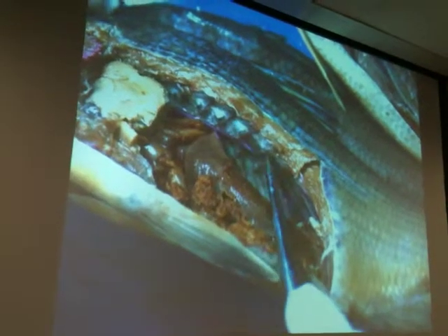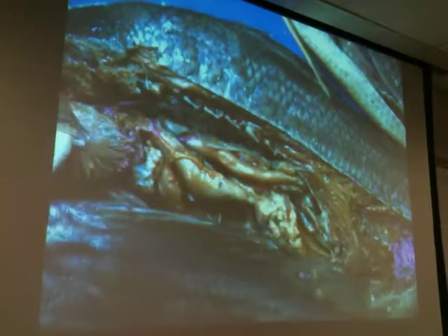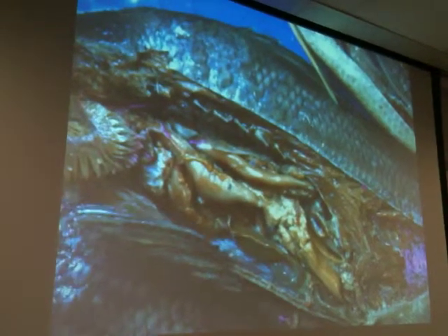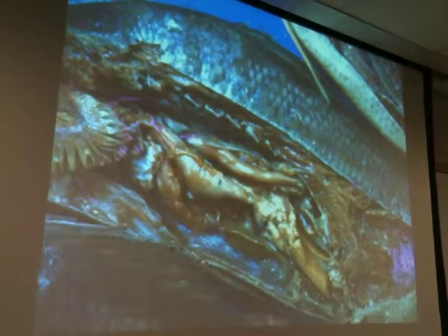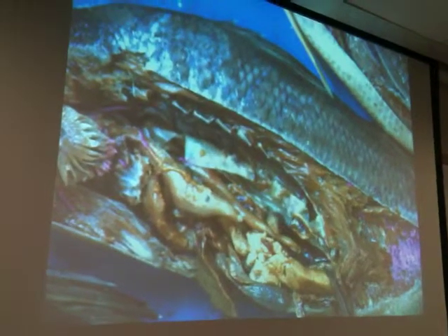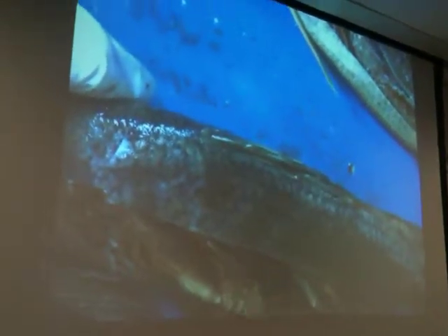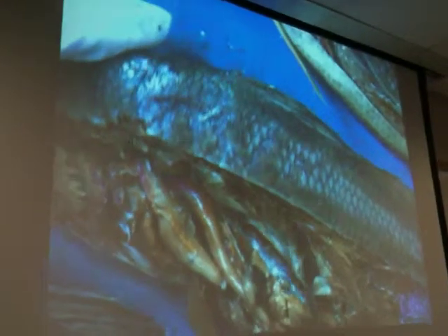Okay, so make sure you can identify the dark spots up there on the dorsal side. There are a couple structures like the ureter and the urinary bladder, which are a little difficult to find on these ones, so I might go around and try to look for an example on your specimens.